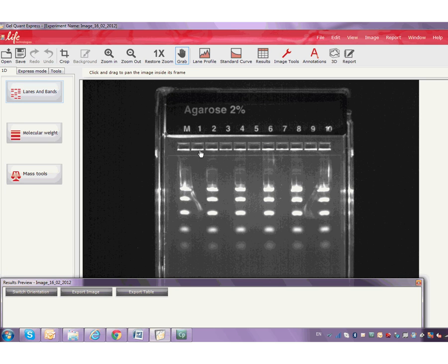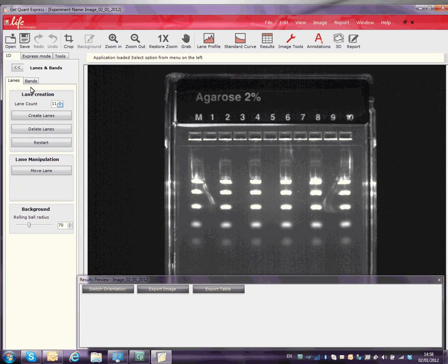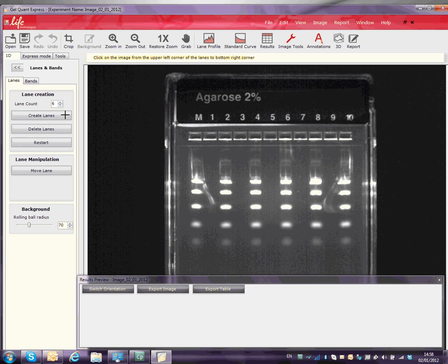To use the 1D mode analysis tool, click on the Lanes and Bands button. Choose the number of lanes you want. Click on Create Lanes and drag the lanes over the gel.